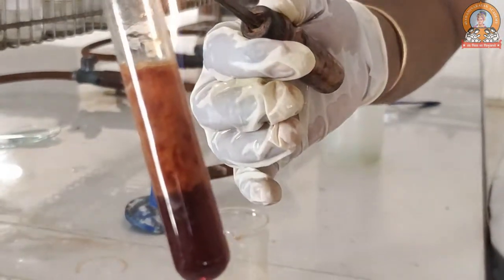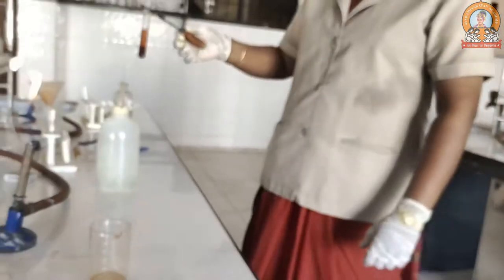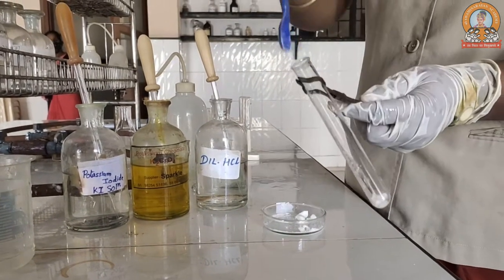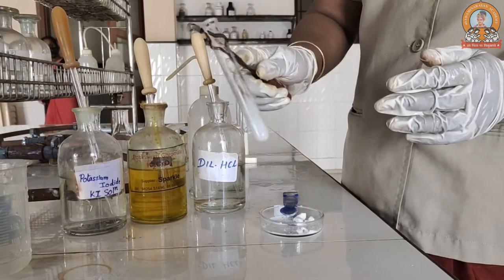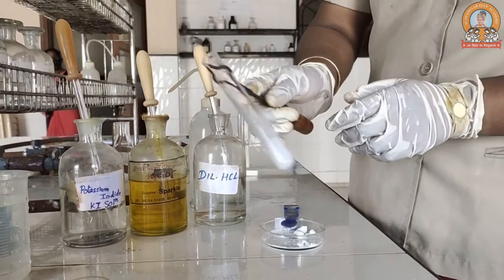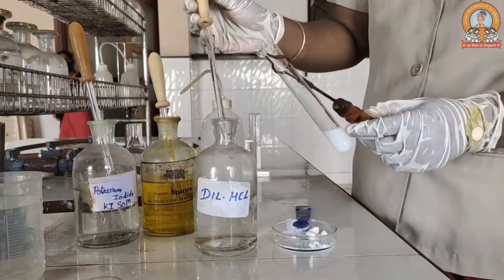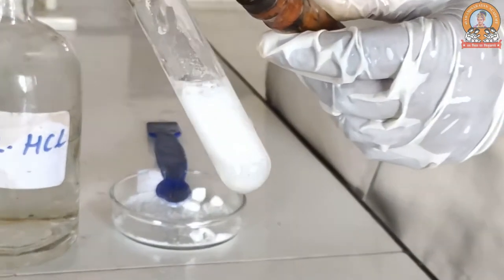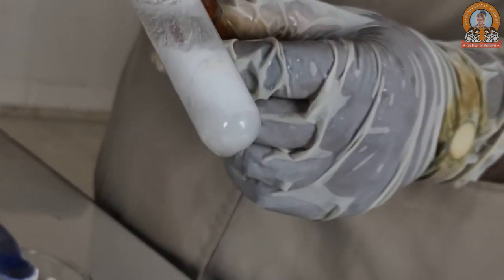You can see the presence of a brown precipitate, which confirms the acetate ion in the salt. Now we are moving towards the confirmatory test for lead ion. We prepare an aqueous solution of salt plus water, and then add the group reagent. Because it is a group one cation, the group reagent is dilute hydrochloric acid. When you add the group reagent, you can see precipitate formation — that confirms the presence of a group one cation, that is lead ion.